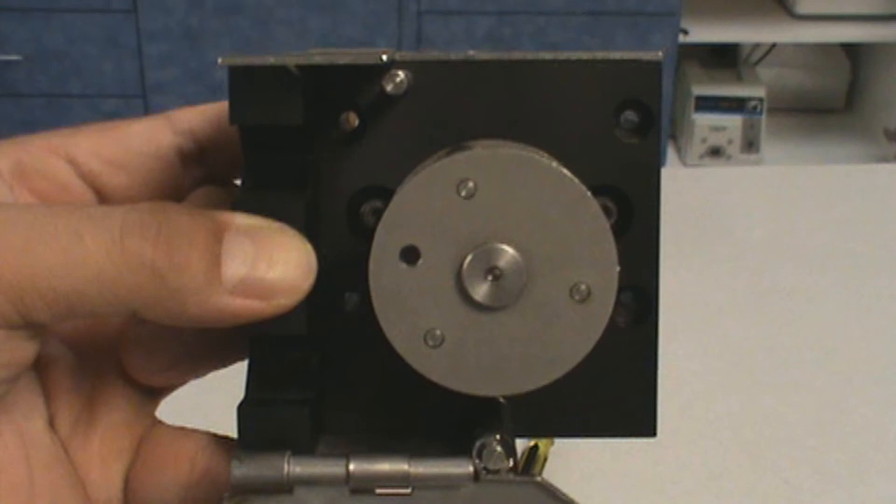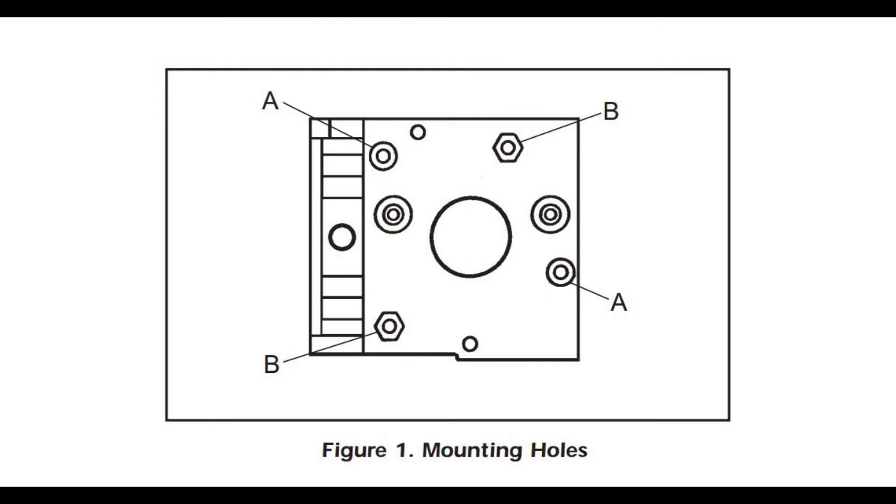You will want to note that if you want the tubing entry and exit to be on the left side of the pump, you will want to make sure to use the round mounting holes labeled A in figure one of the manual. If you want the tubing entry and exit to be on the top of the pump head, you will want to make sure to use the hexagonal mounting holes labeled as B in figure one of the manual.